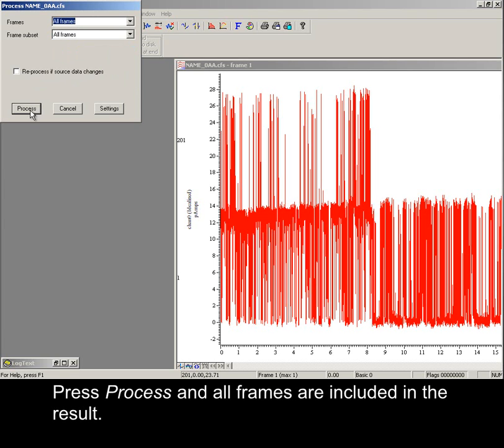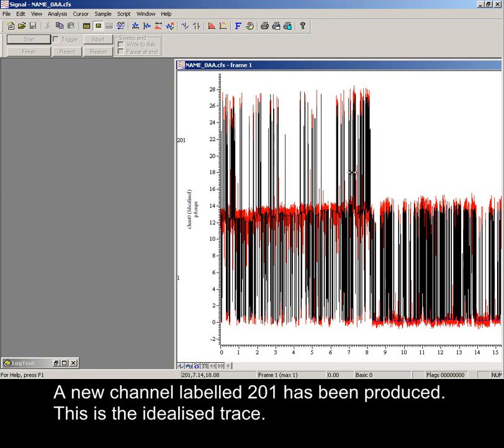Press Process, and all frames are included in the result. A new channel, labeled 201, has been produced. This is the idealized trace.